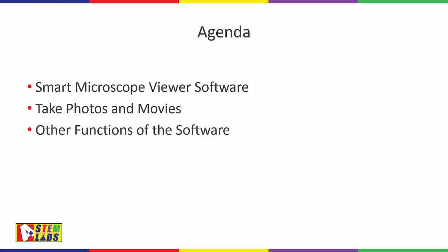In this video, we're going to be showing you how to use the Smart Microscope Viewer software. We're going to show you how to take photos and movies, and we're going to show you the other functions of the software as well. So let's jump over to the Smart Microscope Viewer software.